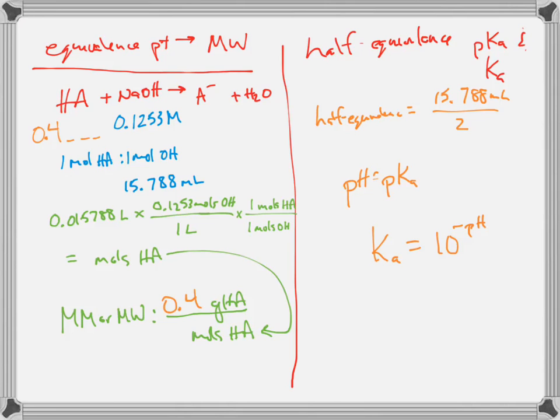And in particular, how information back in the introduction or your calculations either lends credence to your values being good or bad. Okay? So you could go through and discuss why you decided to use the second derivative plot. Okay? Well, why did you not use the pH titration from the get-go?